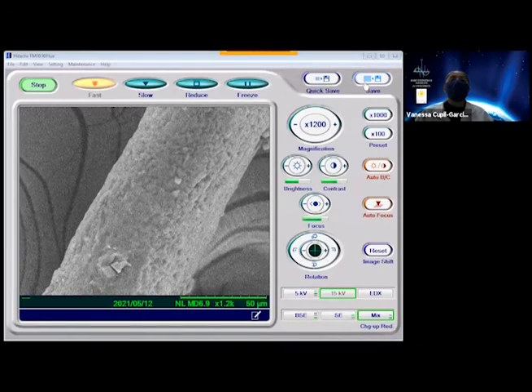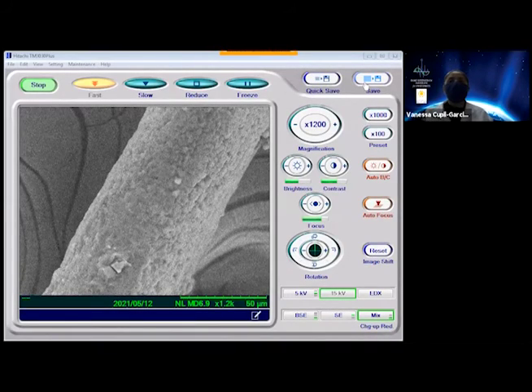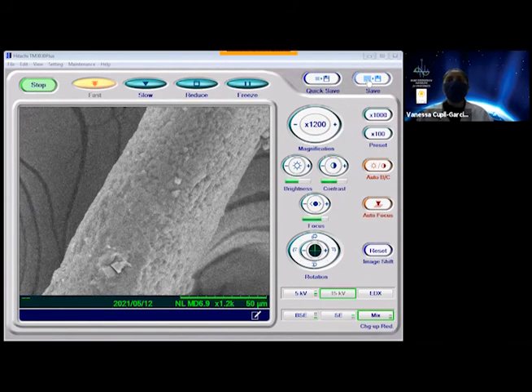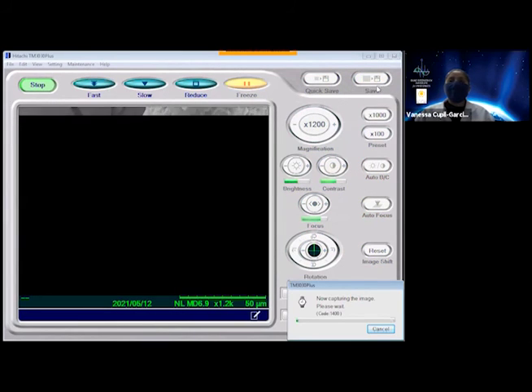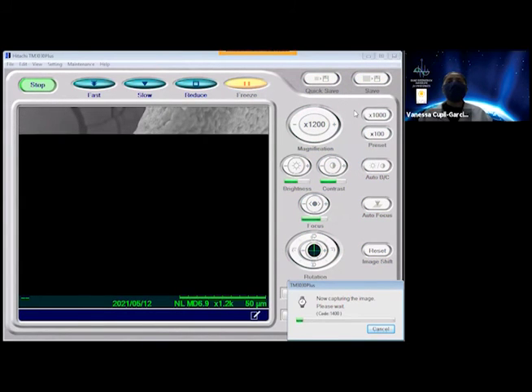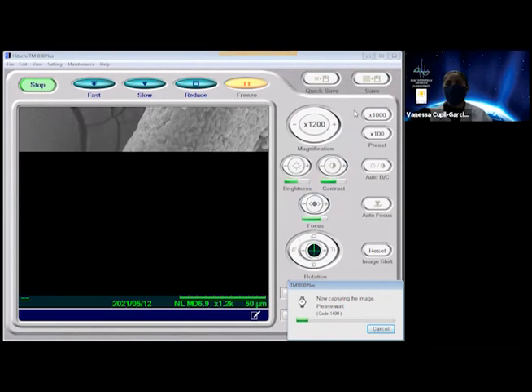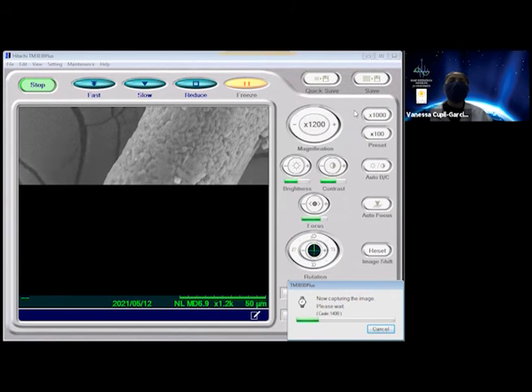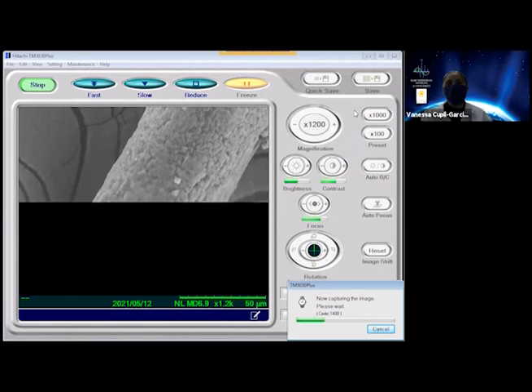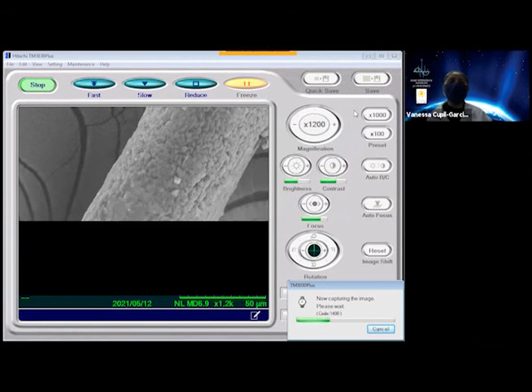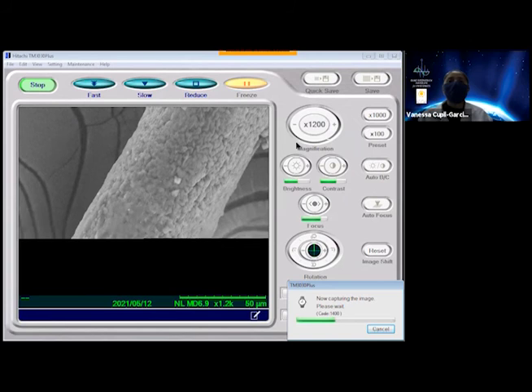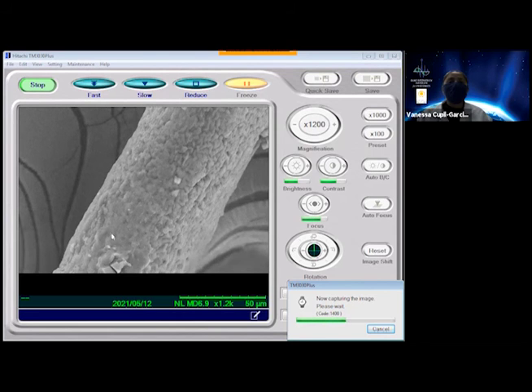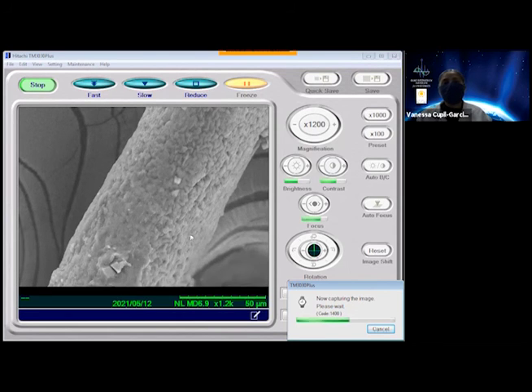And now that we've analyzed our image, we've zoomed in and out using the magnification, we can take a picture of our image that we can save and look at later. So by pressing the save button, it's similar to what you do on a camera when you press on the capture or the take button, and it takes your image. And in this case, once it takes the image, it compiles all those fast scans you were seeing earlier. So that's why this looks a lot better than the live image. And so you can see more of the structures and parts of our hair and what I was talking about with these more scale-like looking structures.